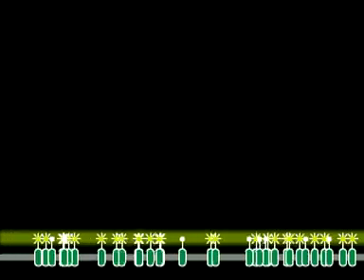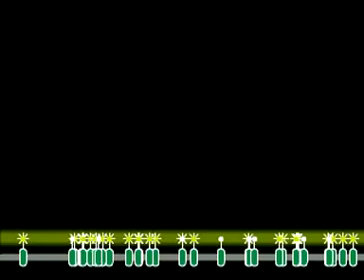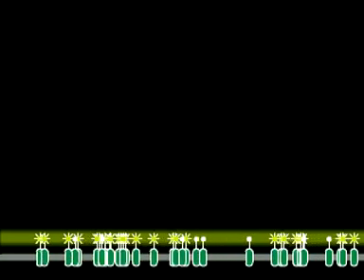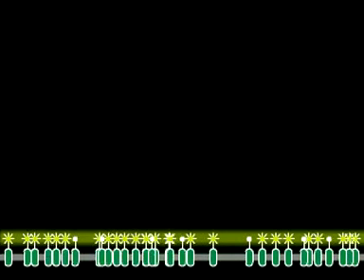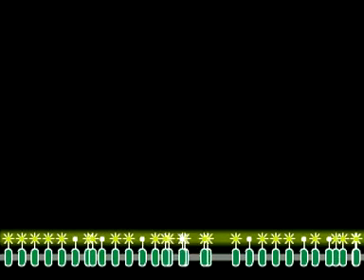From the rate of this fluorescence recovery, the diffusion constant of the protein can be calculated.